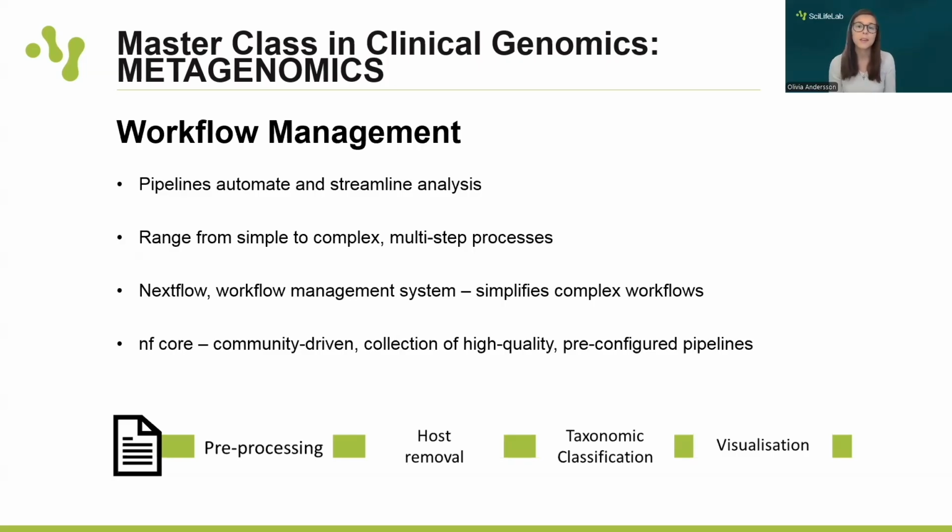Nextflow is a domain-specific language that simplifies the development of these complex workflows. A popular initiative within the Nextflow ecosystem is nf-core, which is a community-driven collection of high-quality, pre-configured pipelines that follow standardized practices to ensure reliability and easy adaptation.